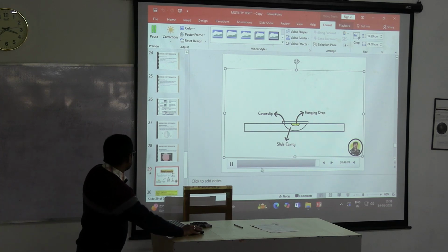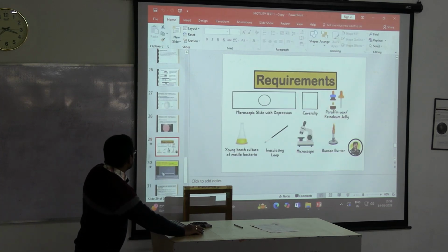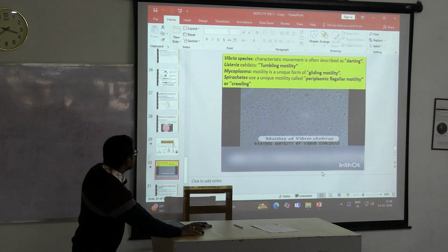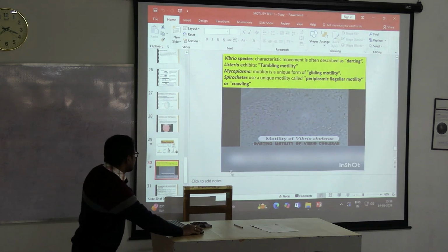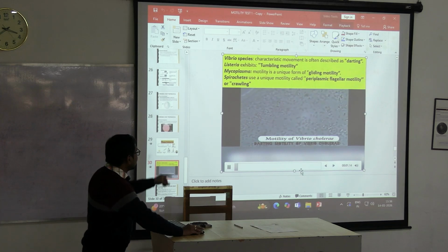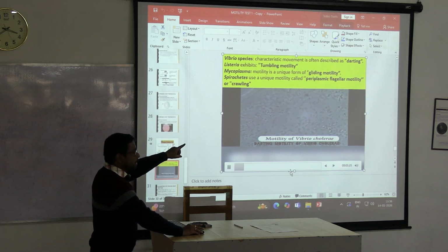And I have another video showing the darting motility of Vibrio cholerae. See the darting motility: the bacteria move purposefully here and there, in the same direction.